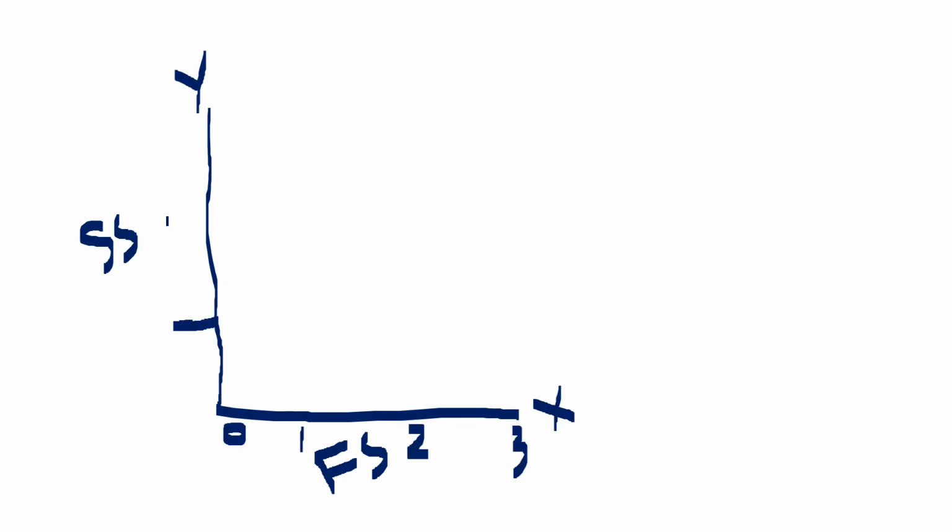Now I will show you a graph. This is called gating in flow cytometer. So in this graph, the bottom will be the forward scattered light. This is a forward scattered light graph, and this side one is side scattered light. So here this is x-axis and y-axis. Okay, so 0, 1, 2, 3, 1, 2, 3.